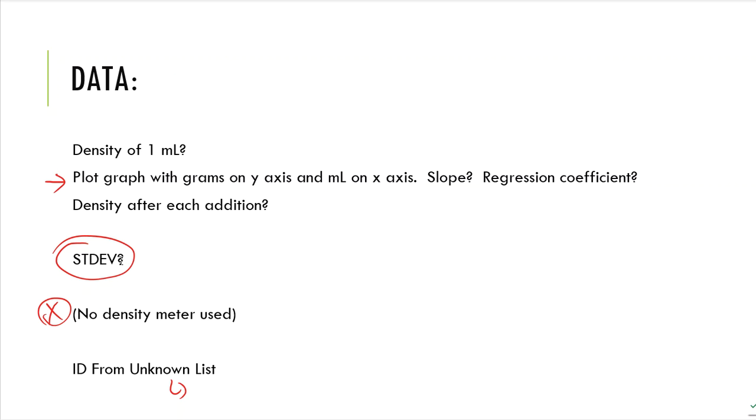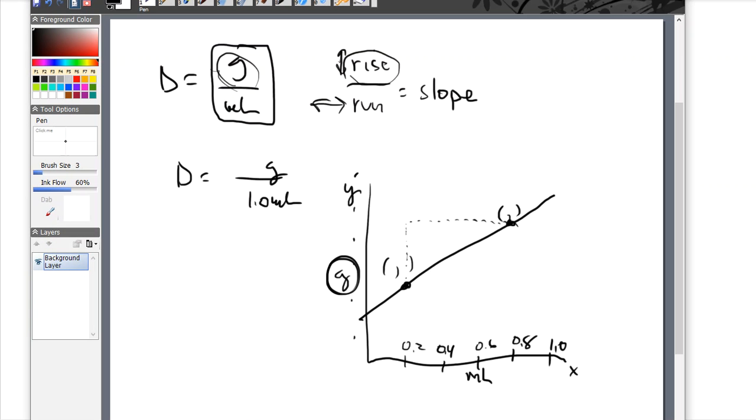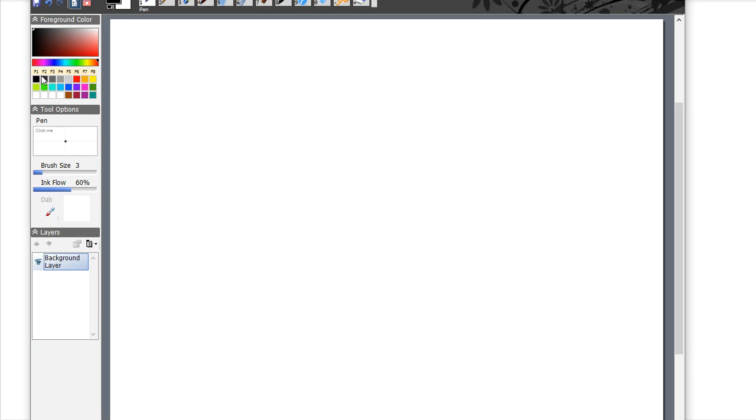Finally, next is standard deviation. Okay, so what is standard deviation? For those of you that have never provided standard deviation in a laboratory before, standard deviation is a way that we can look at how close the data is together. So what we're going to have here is multiple density measurements, because we added 0.2, then we added another 0.2, then another 0.2, then another 0.2, and we calculated density for each one of them, right? So each one of those numbers might be slightly different.